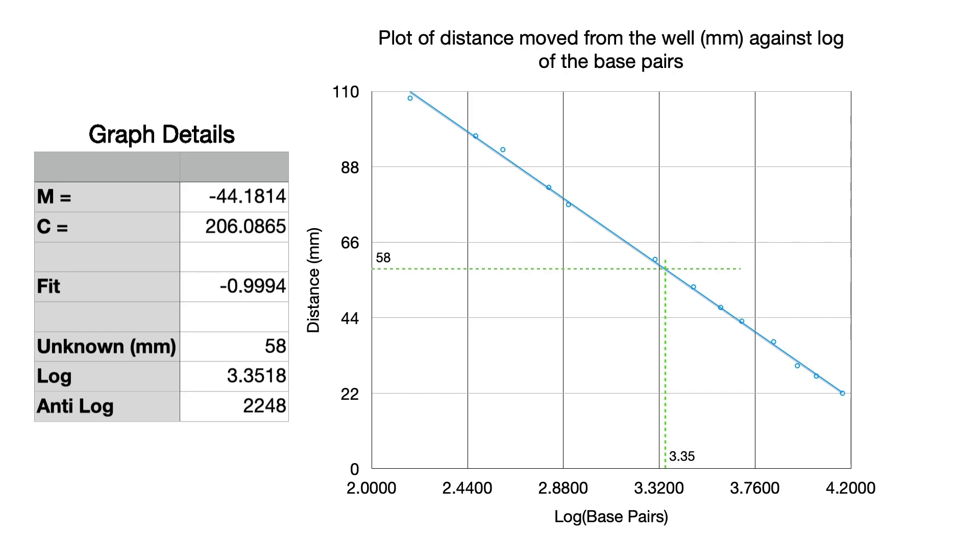So we would say that the band is 2200 base pairs because this approach isn't amazingly accurate, it's an approximation that we're getting from this type of calculation.